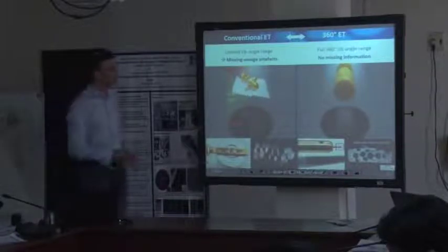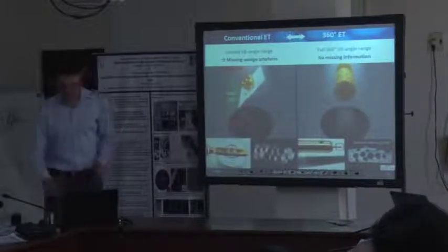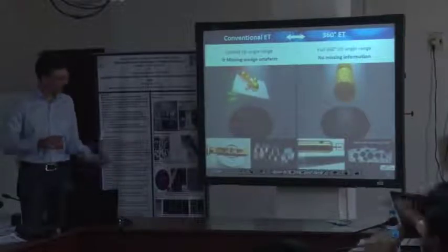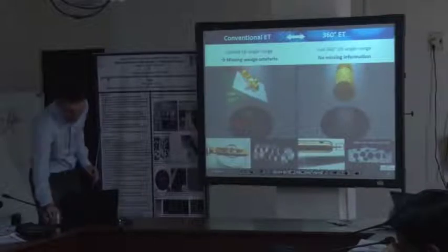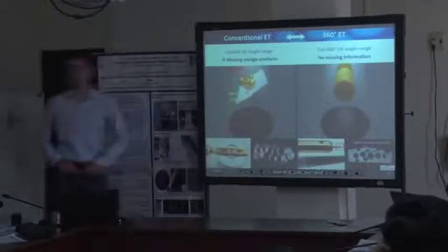In the transmission electron microscope, we have two ways to record a tilt series. The simpler way, and there are many holders available, is a very thin regular holder that just clamps our TEM sample.